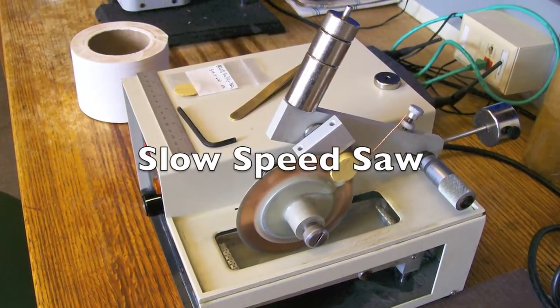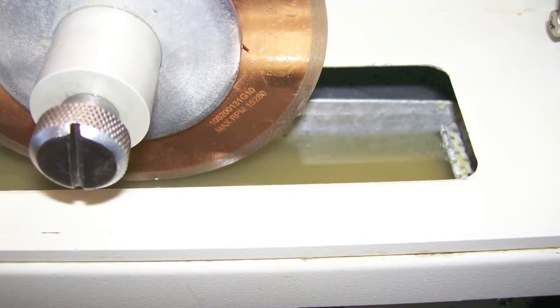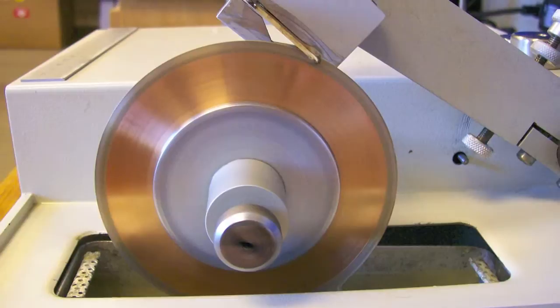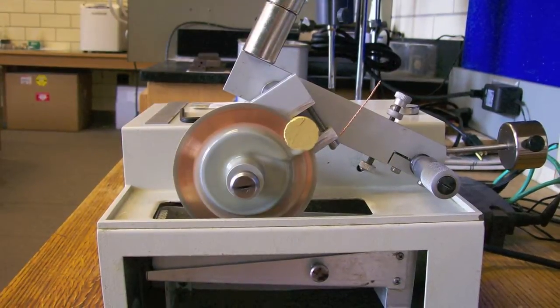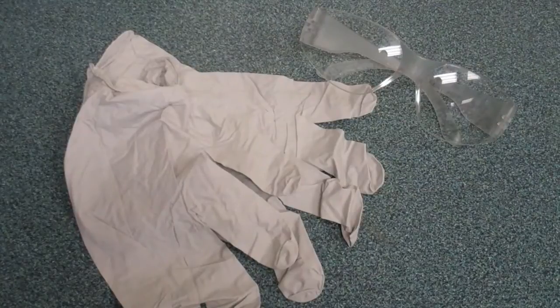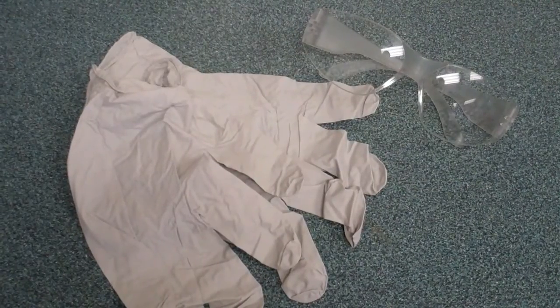The slow speed saw is the instrument used to cut samples for the various thermal and mechanical devices. The instrument consists of a variable speed motor blade and an oil bath. Be sure to wear proper personal protective equipment including gloves, goggles, and a lab coat.